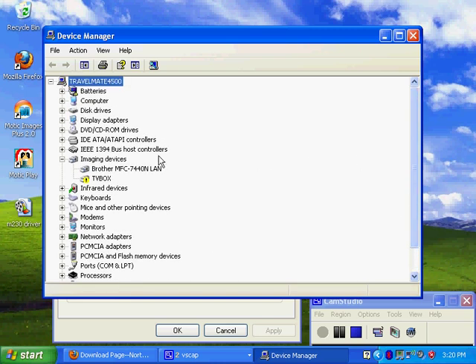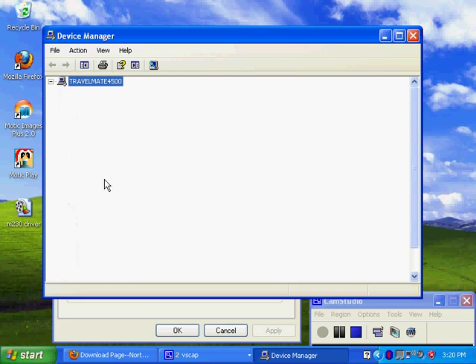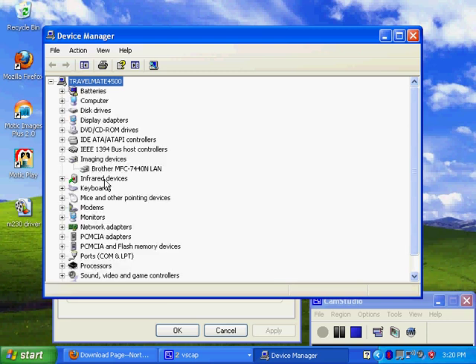How to make sure you have identified the correct component that is your modicam or microscope is just to unplug and re-plug in the USB cable. If I unplug my USB cable right now, you will see device manager refreshes itself and TV box is gone. That way I know for sure I have identified my modic product on my computer.